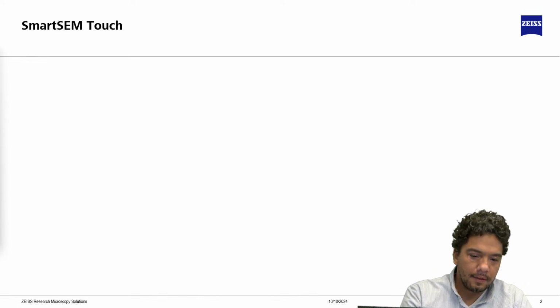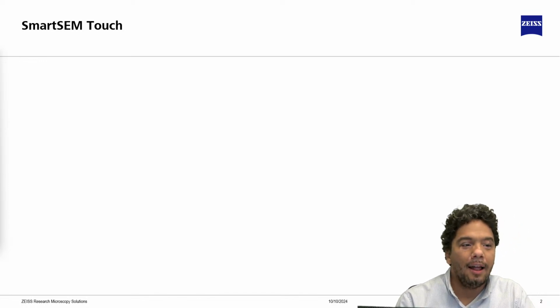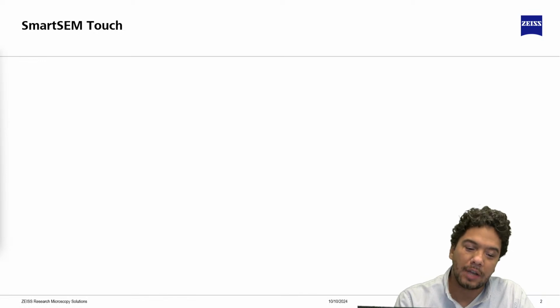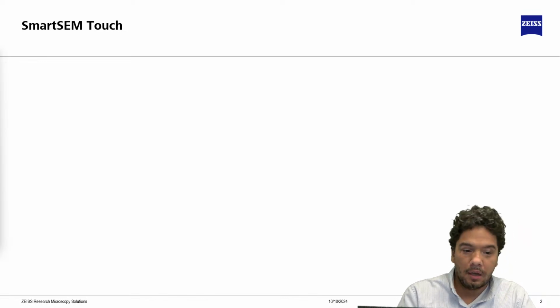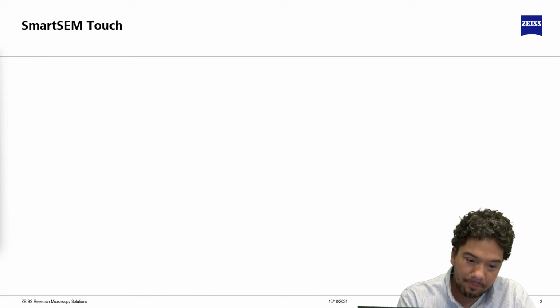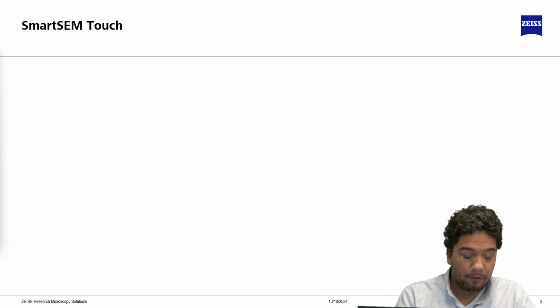Okay, let's discuss SmartSEM Touch. Let me introduce you, if you don't know about it, to its capabilities and how it can help you in your day-to-day imaging workflow for the electron microscope, basically the scanning electron microscope. Let's discuss some facts that are probably familiar to you.